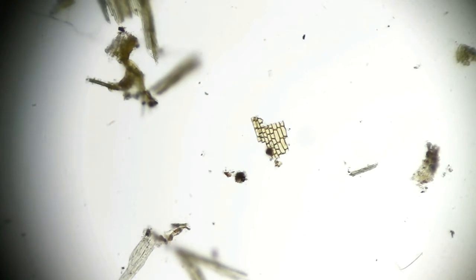So I see quite a lot of these when I'm looking through samples, looking for tardigrades, and I always find them so interesting. It reminds me of when we first looked at onion skin under a microscope when I was at school, and just seeing how unbelievably different plant cells can look. So definitely look out for that if you try to recreate this experiment.